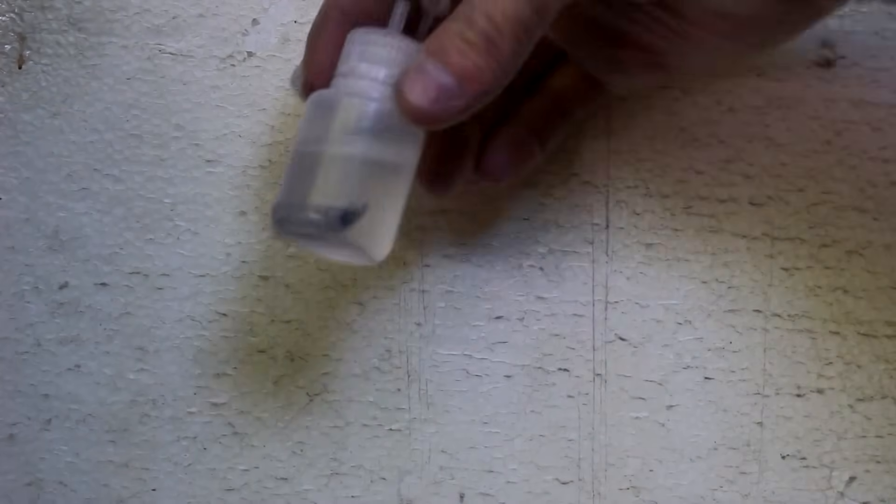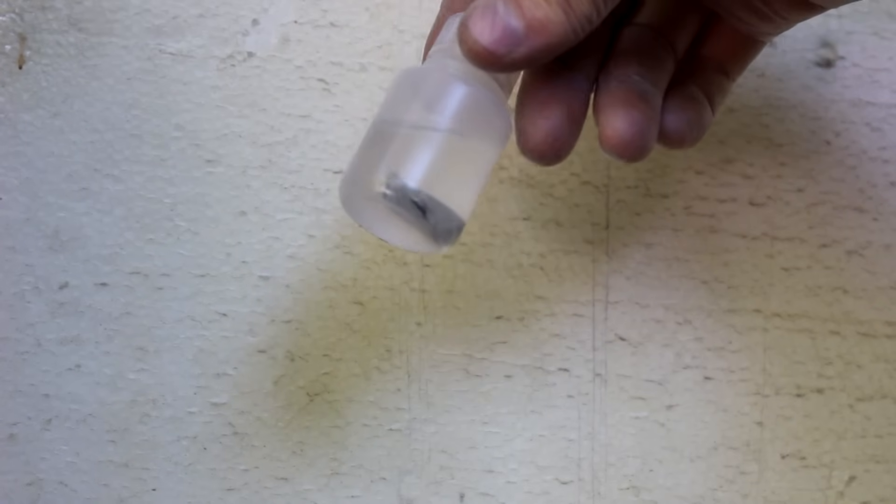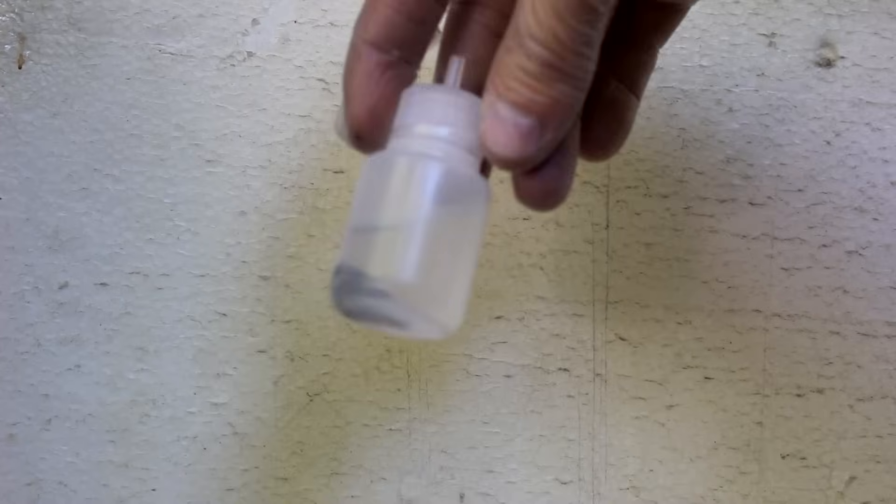This is stannous chloride right here. Notice it's basically just hydrochloric acid with a little bit of stannous chloride dissolved in it, along with a piece of tin to keep it fresh.